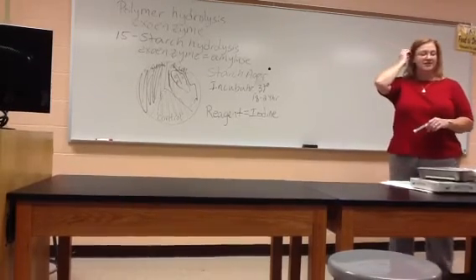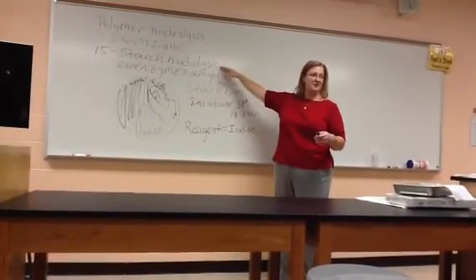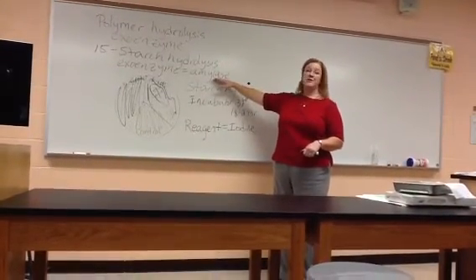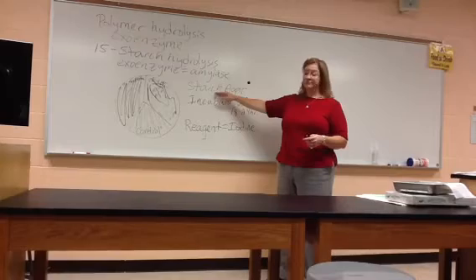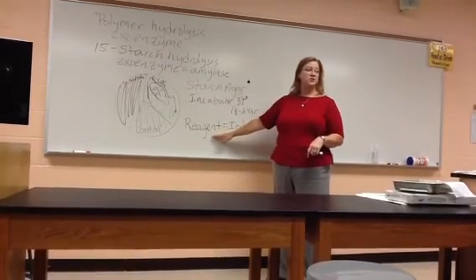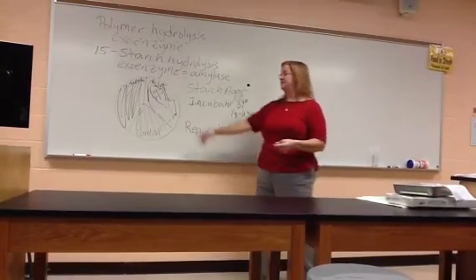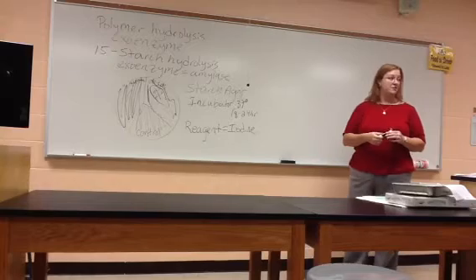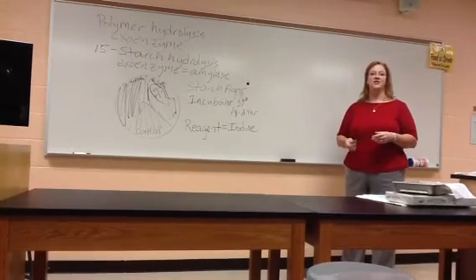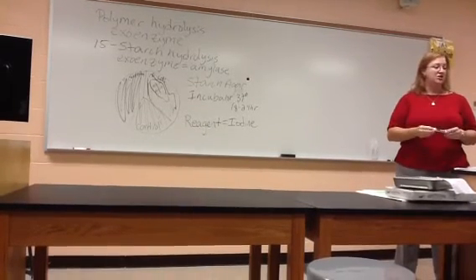Okay. So things to study for next Wednesday's quiz. You want to know, obviously, the name of the test and the reason you're doing it: find out if they produce amylase and can do starch hydrolysis. The name of the exoenzyme, which is amylase. The name of the media that we use, starch agar, for this one. Any reagents, this one has the reagent of iodine, to help us tell positive from negative. What positive and negative look like: positive, no black color; negative, has black color. And what positive and negative mean: positive tells us they produced amylase, negative tells us they didn't. And that's all in your learning objectives. Look at that whole list of things you need to know.